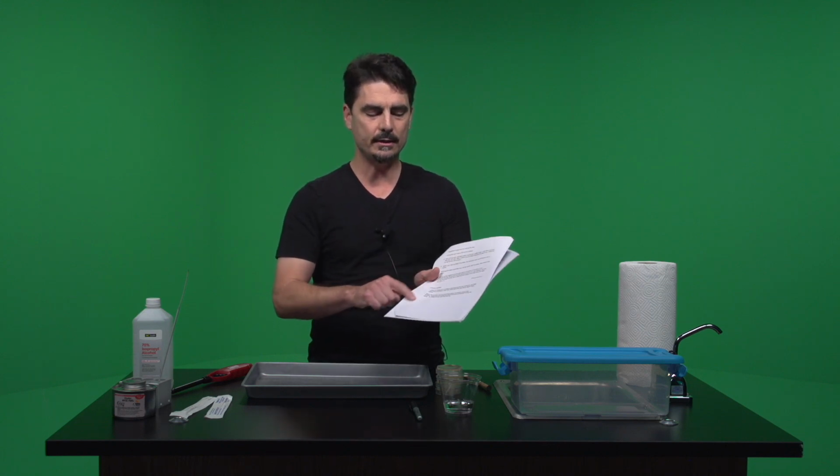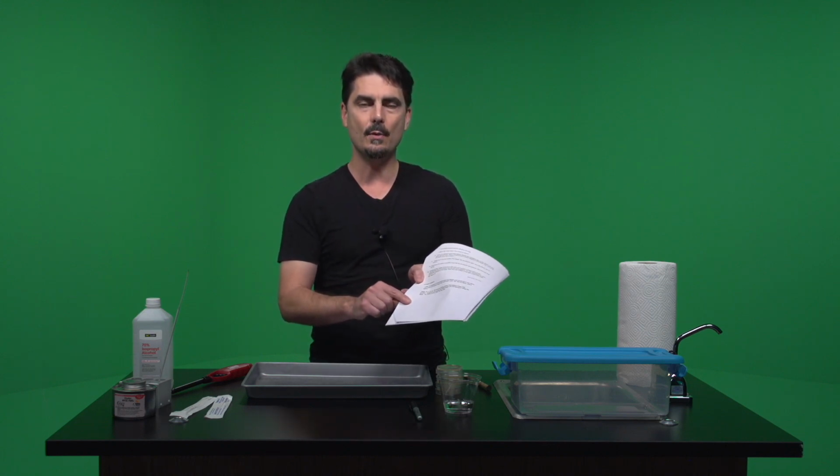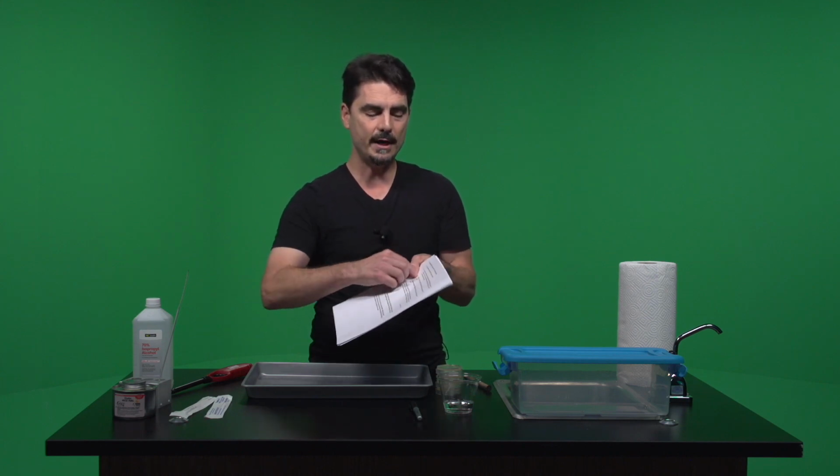It's really important before you start doing any labs to read the entire lab, look at the Willette additions, and then probably print this out, say step 14, then go find step 14 and make an annotation on there yourself. The software where I made the annotations only allows me to do it in certain places. Otherwise, I would have just changed the text right up there. But I didn't have the capability of that, so do that.